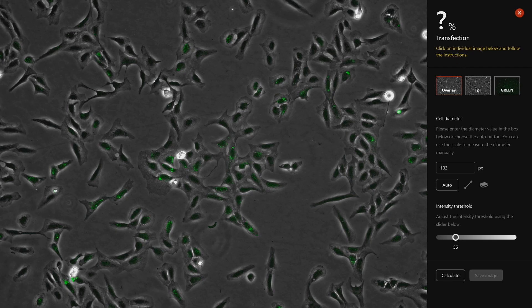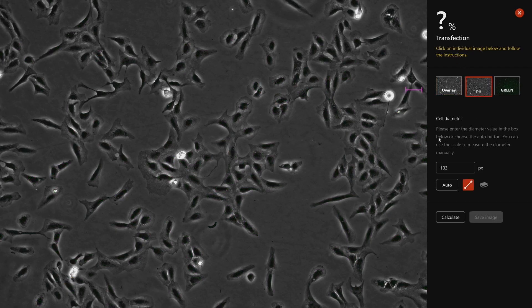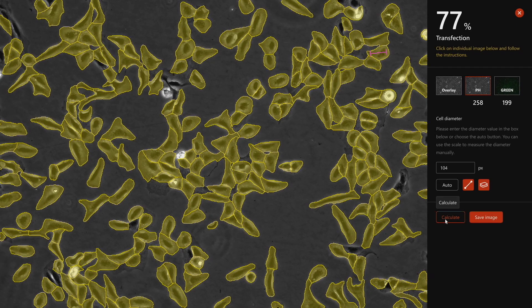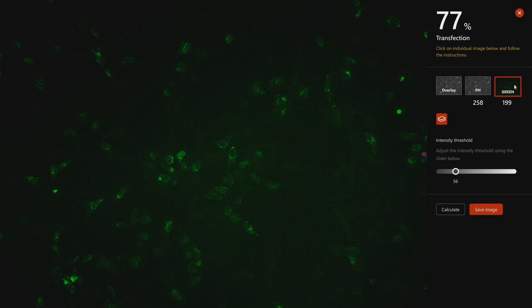First, measure the diameter of your cells manually or automatically in phase contrast image. Then, adjust the threshold in the fluorescence image.